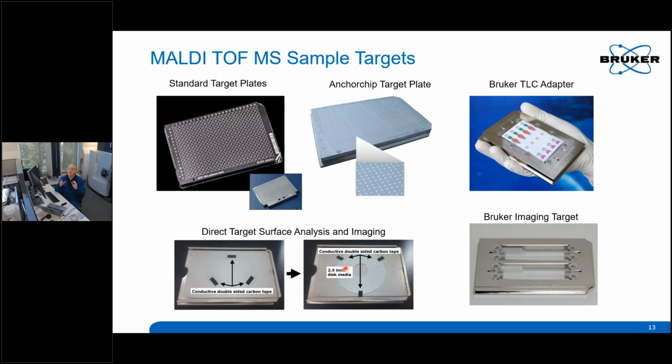The main take home from here is that we don't want any liquids or loose powders or loose materials going into the source. They could fall off, contaminate the source, and cause a lot of problems. So, thin layers of things that are affixed to the target surface.